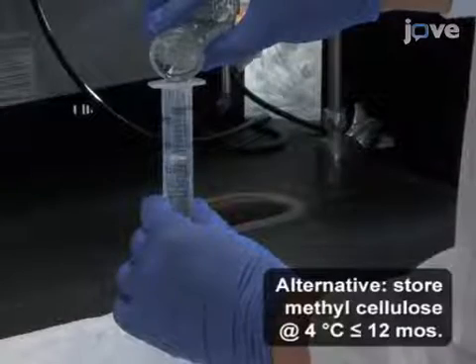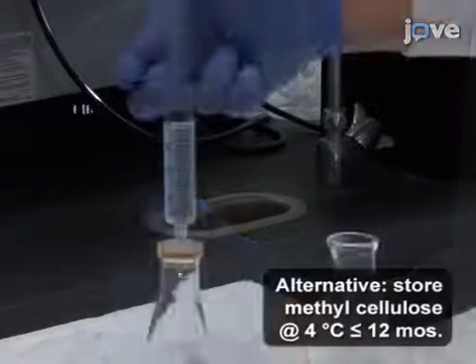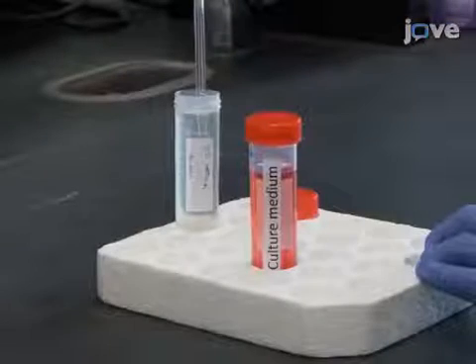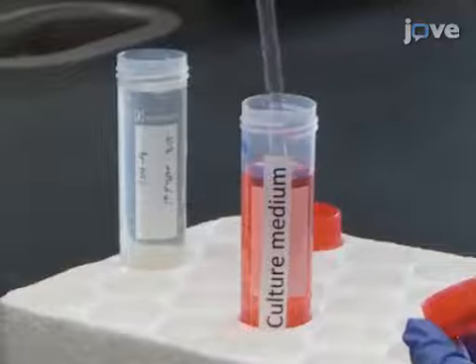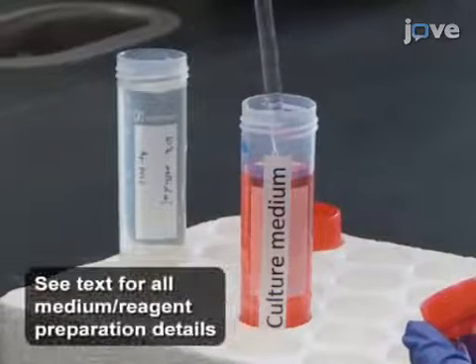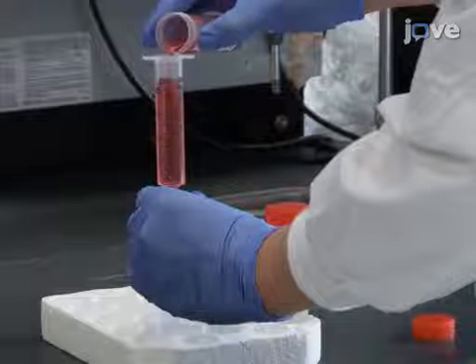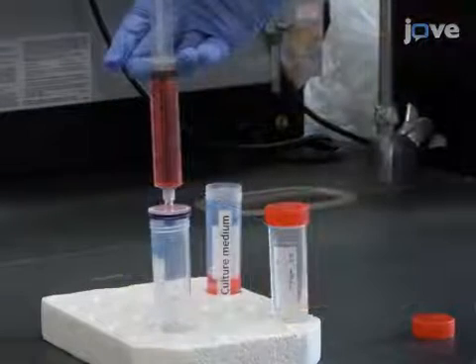Pass the solution through a 0.45 micrometer filter to remove any undissolved fragments and dilute 1 to 5 milligrams per milliliter of the filtered solution in the appropriate culture medium. Then filter the methylcellulose-supplemented medium through a 0.22 micrometer strainer.